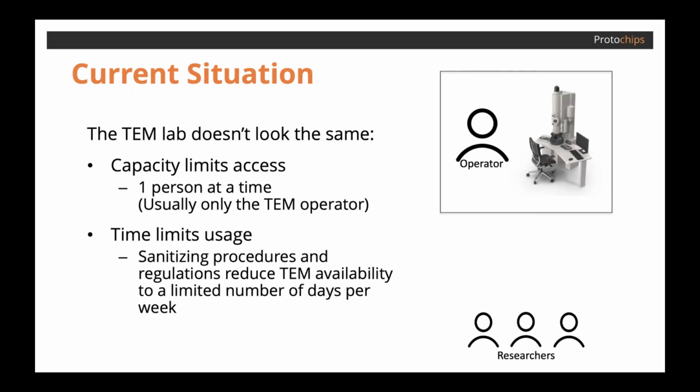Due to increases in cleaning and sanitizing procedures, the time available at the TEM lab has been reduced. Whether the reduction is in the number of hours per day or the number of open days per week, the limited time is delaying the onset of experiments, and it's breaking up experiments into multiple sessions. So the unavoidable reality becomes the disconnect between researchers and their research tools, and it's forcing everybody to come up with a new approach and consider new ways to do this.